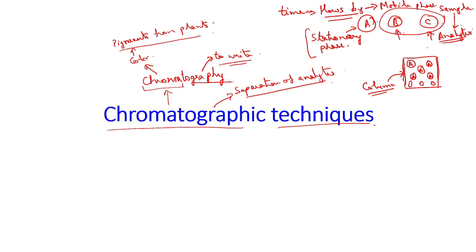Now what we do is inject the sample within the system, and they are coming. How is the sample being injected within the column? In our example, we are injecting it with respect to time. We are diluting it in time, because the persons are coming at their own specific time. So the B and C are coming inside.